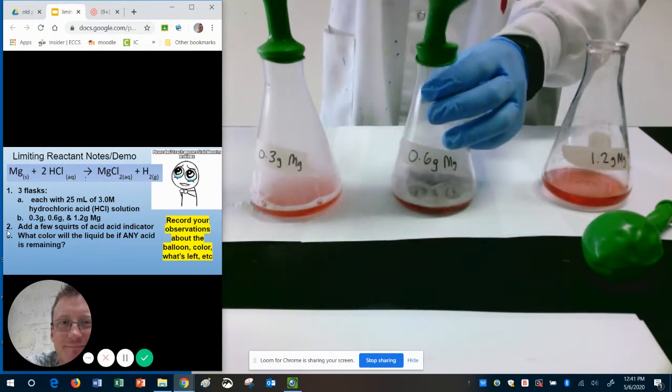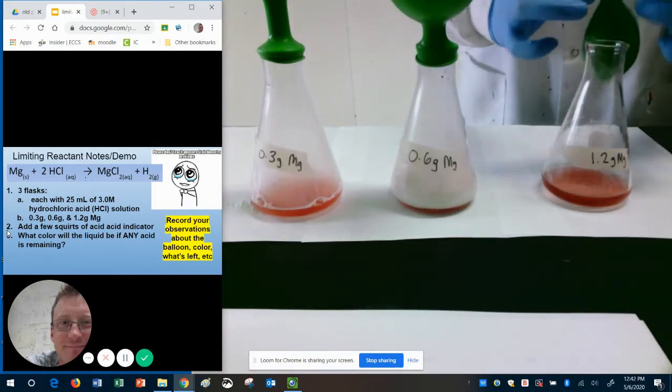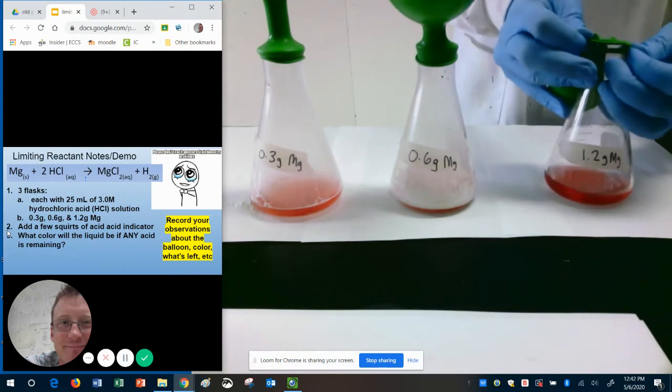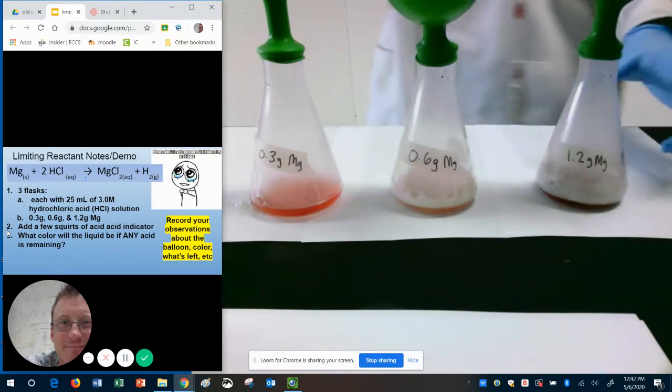Here's the second one. See, that one's reacting a lot more. It has more magnesium. Again, keep in mind, all of these have the exact same amount of acid in them.